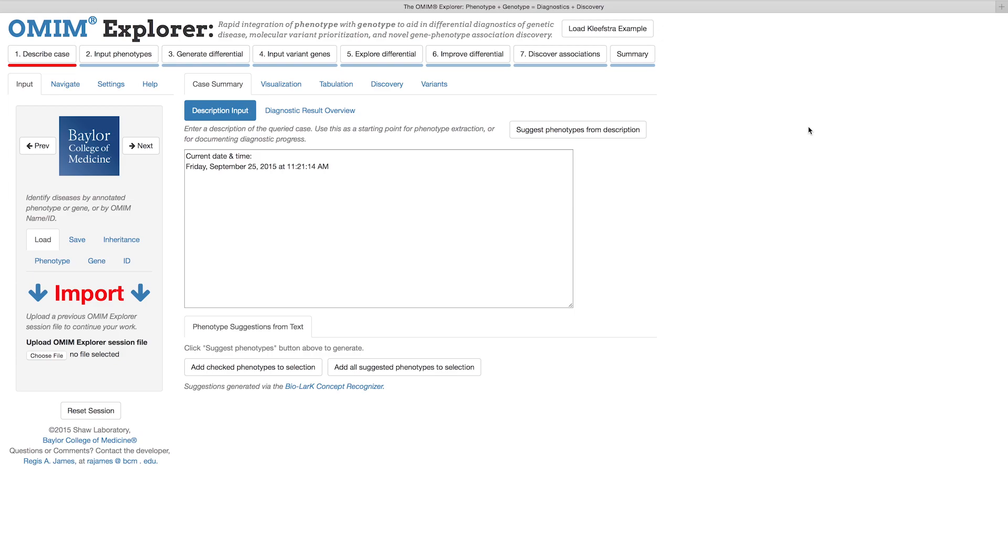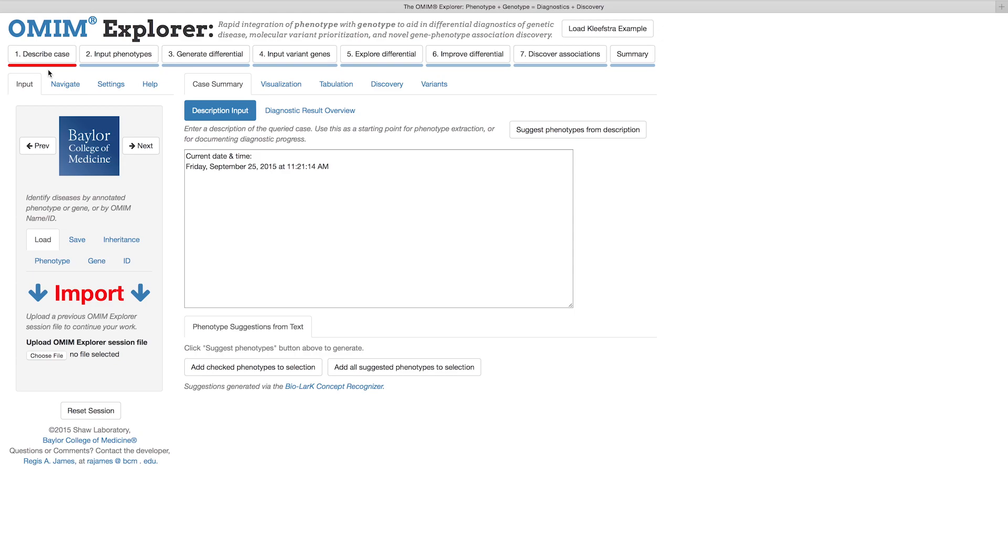Note that there are next and previous arrow buttons here on either side of the Baylor College of Medicine logo. You can progress through the Workflow Wizard either by using these arrows or by simply clicking directly on the Wizard Workflow buttons at the top of the screen.